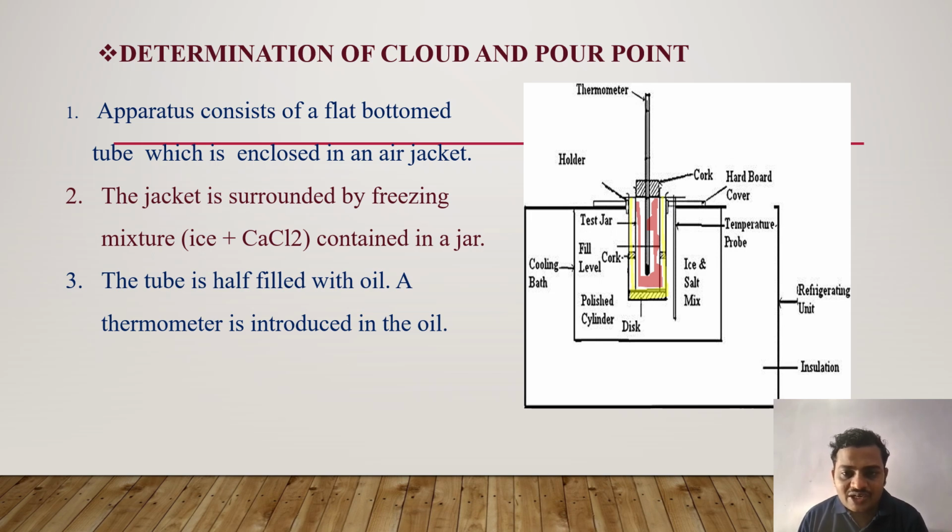The temperature of that oil is recorded with the help of the thermometer. This test tube which has a flat bottom is surrounded by an air jacket, and that air jacket is surrounded by a mixture of salt, that is calcium chloride, and ice.